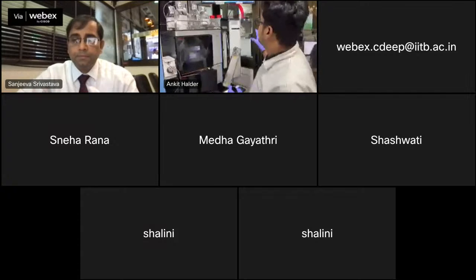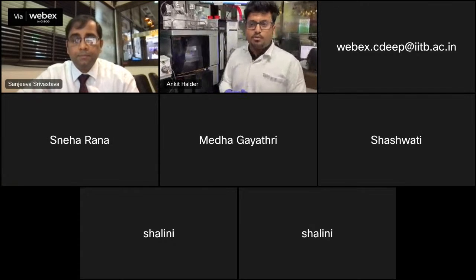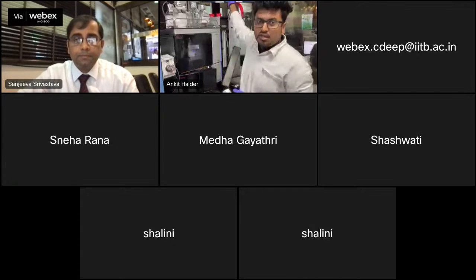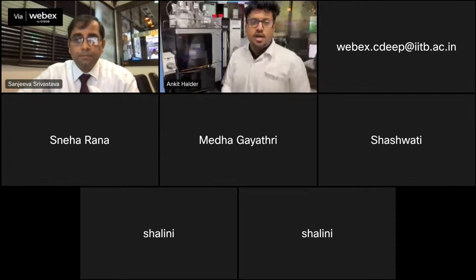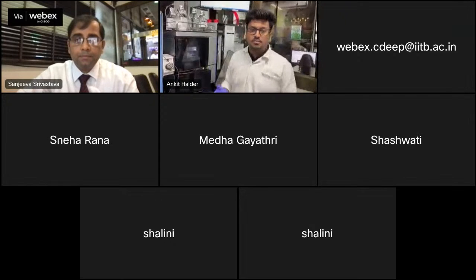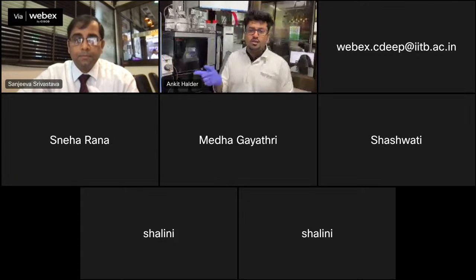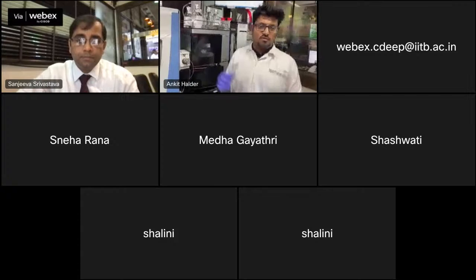So this is how a setup of a Q-Exactive and the UHPLC helps us to generate global metabolomics data. Further, if we identify some metabolites from here, we can also use this experiment for making a targeted SIM study. That means only those particular metabolites will be taken forward and can be checked in a larger number of samples.